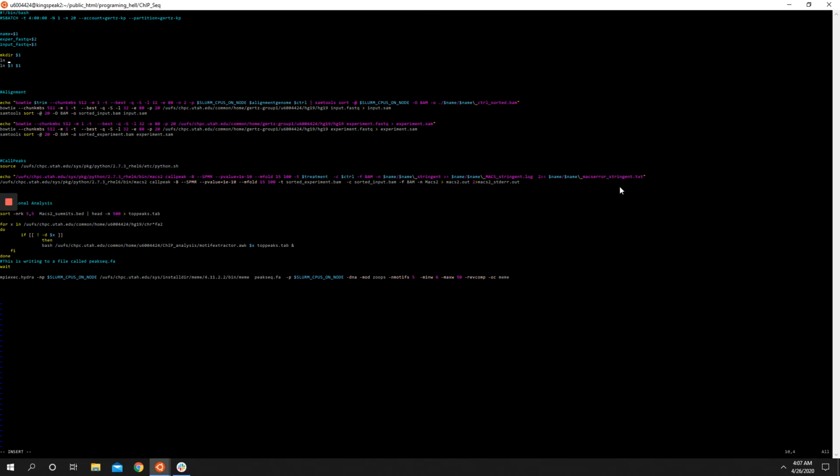Link $experimental FASTQ into our folder, which will have our experiment name, and then we'll link input.